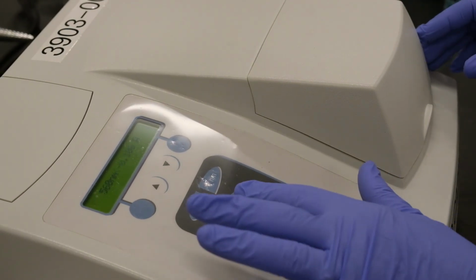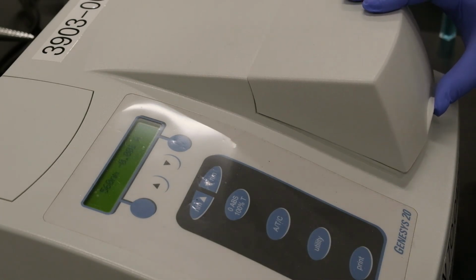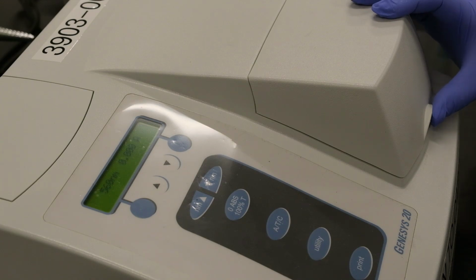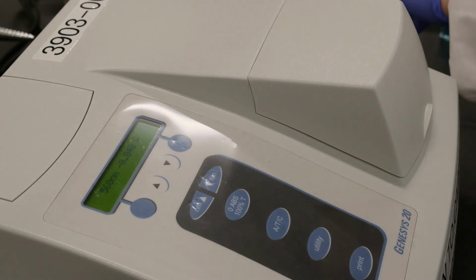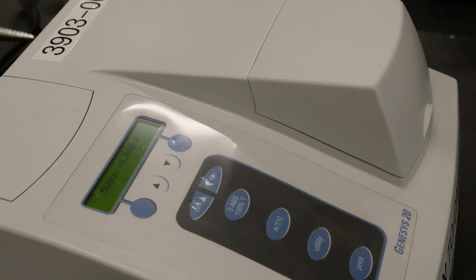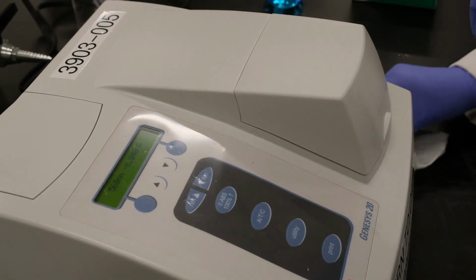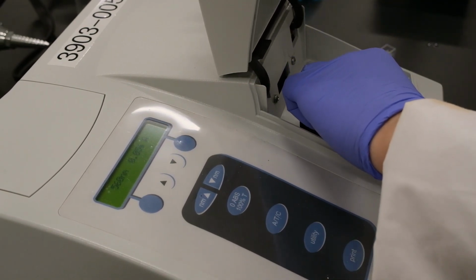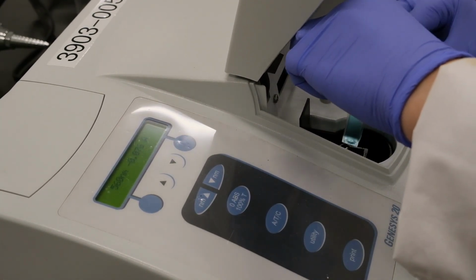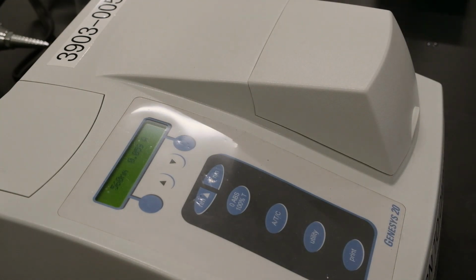Okay, so we are going to zero the machine. We put in the blank, we have the 0 here, remove the blank, clean with paper tissue our solution in which we diluted 3 milliliters of the brilliant blue, insert it, and do the first reading.